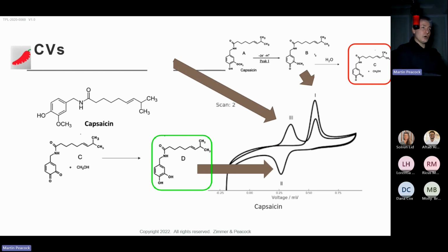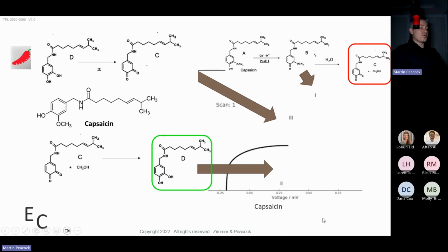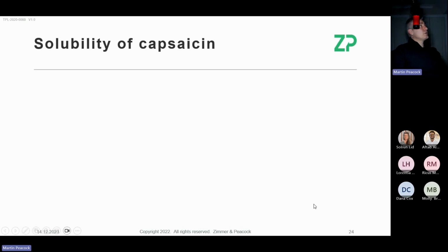Like I say, my intention's not to lecture on electrochemistry. It's just to give you a sense of why some of the peaks, which I'll show later on, are coming from the voltammetry of capsaicin. So now I'll move forward a little bit faster. If you're interested in chili sauces, that's great.